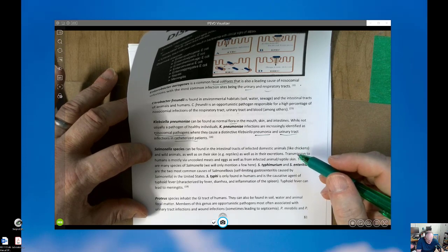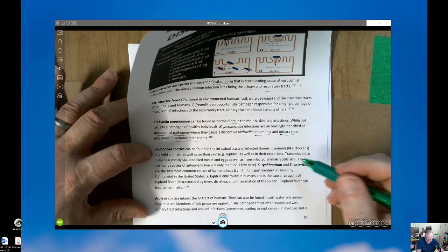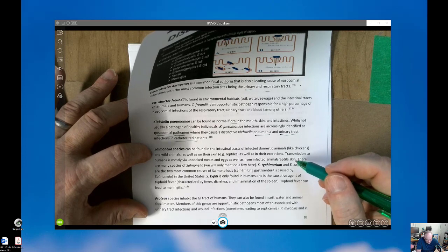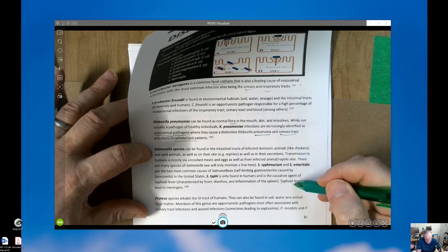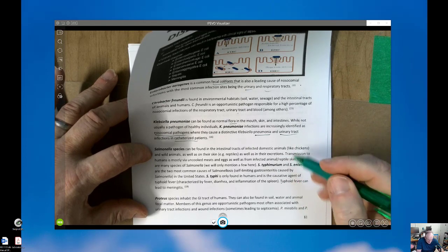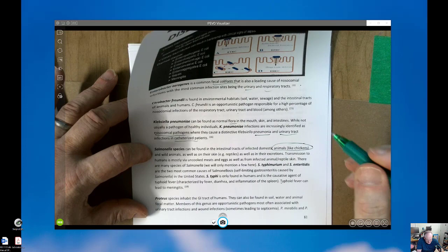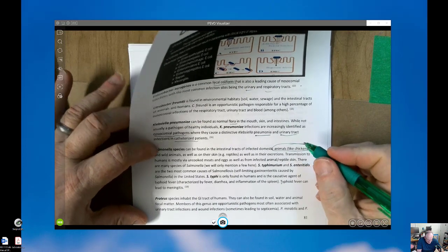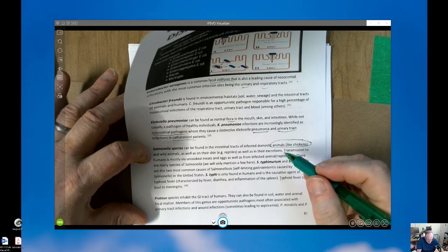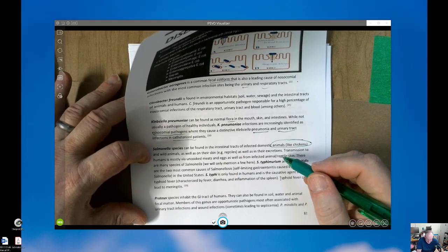Salmonella species. Now, Salmonella is a close cousin, or kissing cousin, of E. coli. And they're really hard to distinguish Salmonella from E. coli, typically, when we see these. Of course, Salmonella species are giving a lot of problems on the veterinary side of various things. You'll know if you get food poisoning from Salmonella.